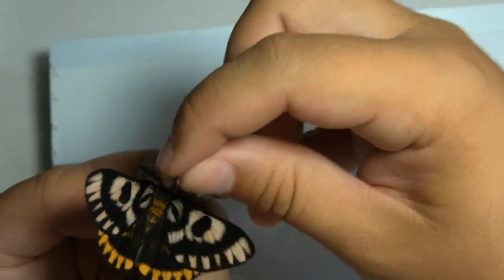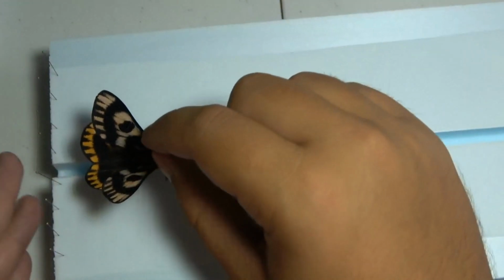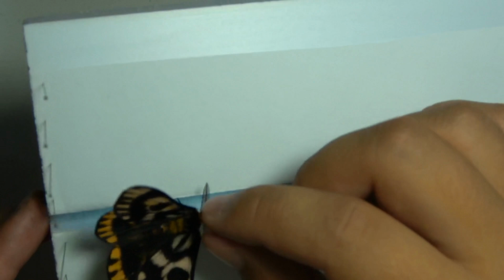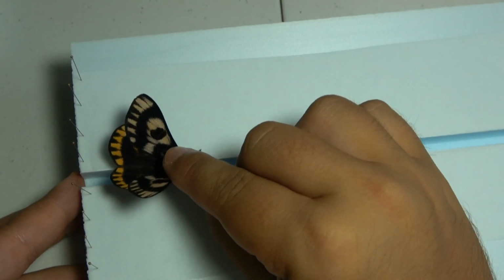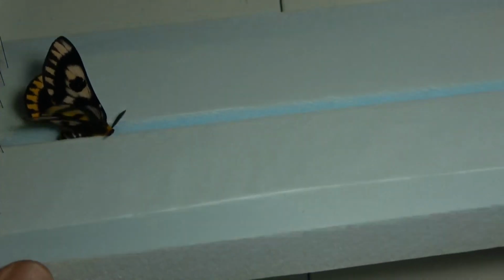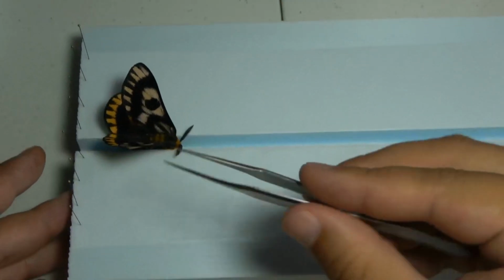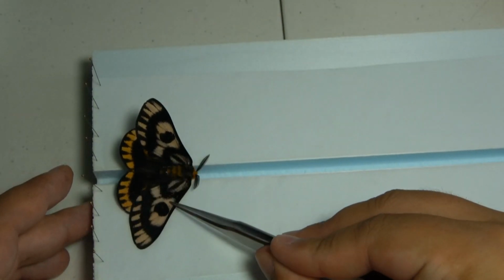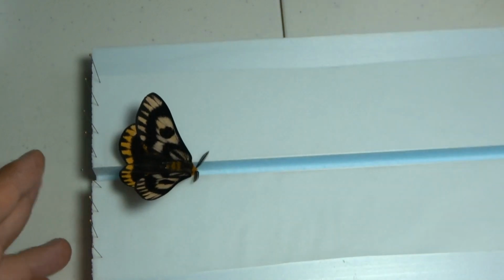So once you have your butterfly or moth on the pin, stick it in the groove. You want to get the pin in the middle of the groove, so the body is in the middle of the groove. You push down, and you want to get the bottom of the wings as flush as you can with the board. When I have the specimen down, I like to take the forceps and just push the wings down and make sure I'll be able to move them. Let's do that.